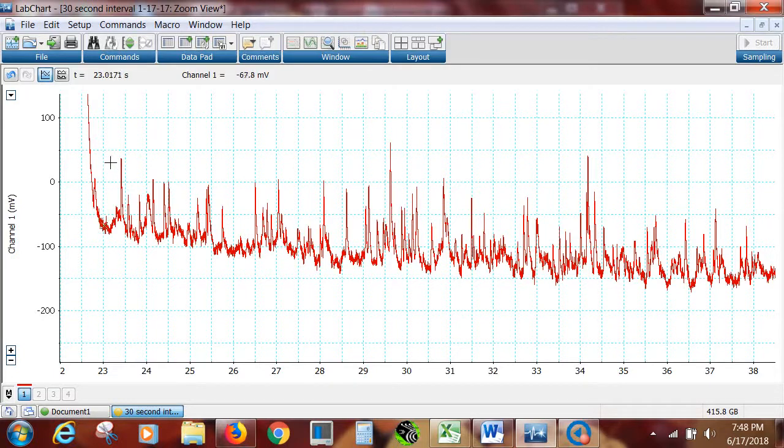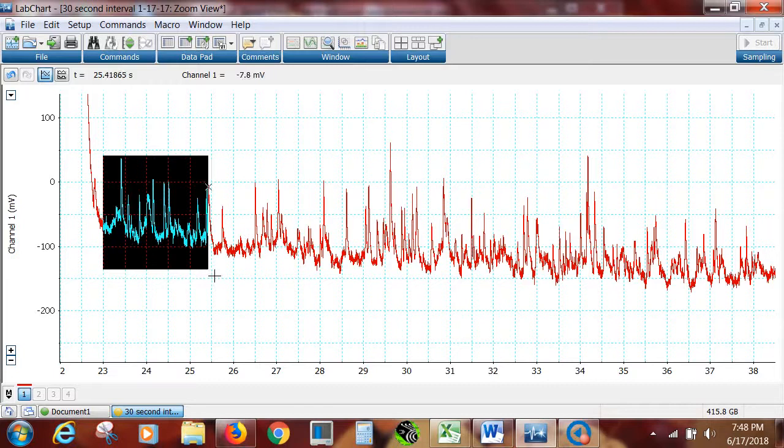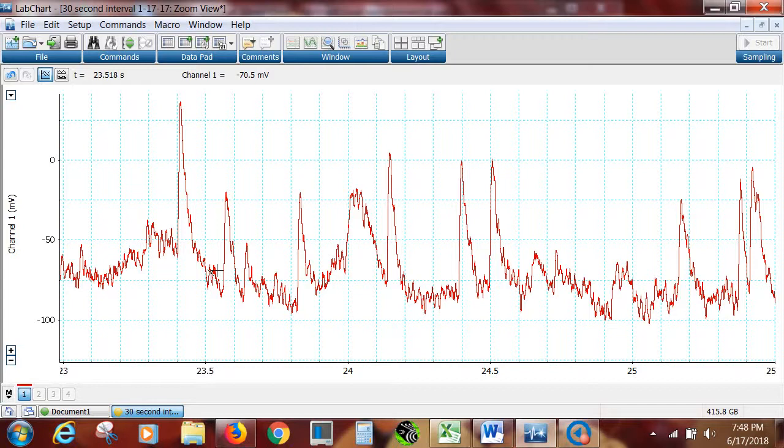So I think taking some space, like maybe a second or two, and let's go to 25 so I can maybe get an even number here, or 25.5. There we go. You see, almost there. There's 25.5. Okay, so now let's count how many minis we might have here from 23.